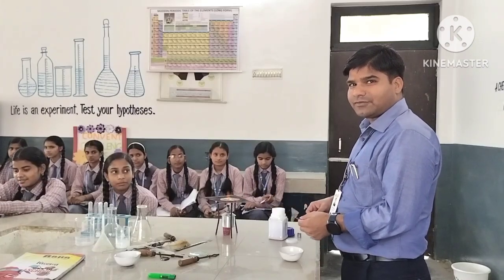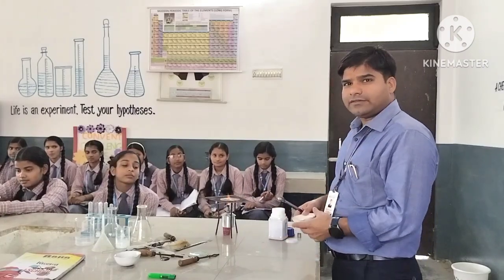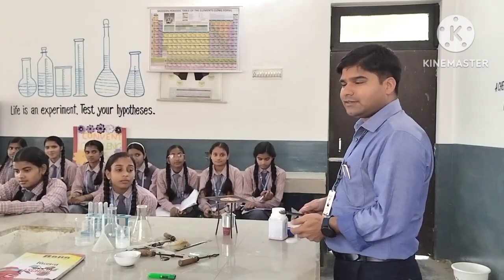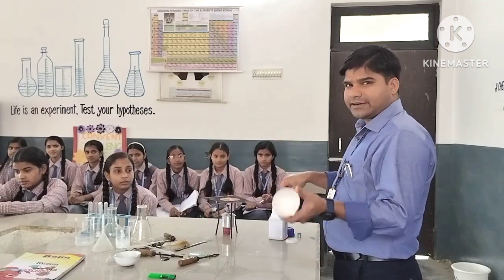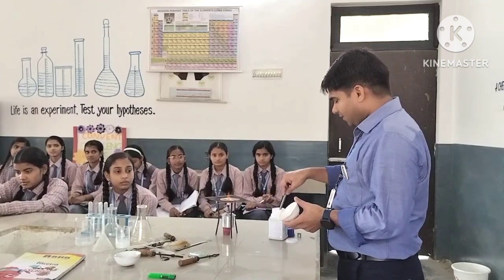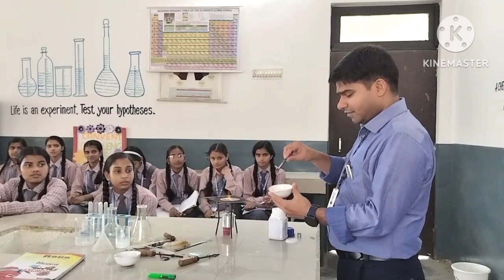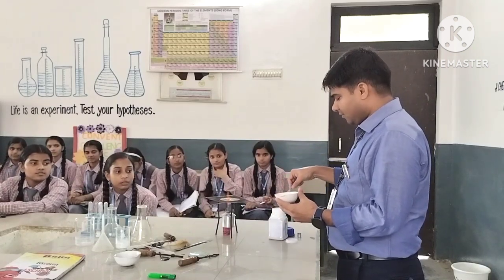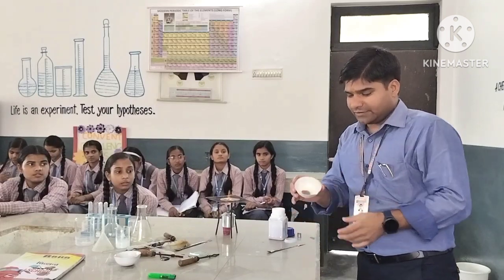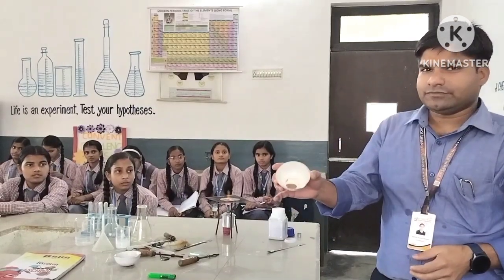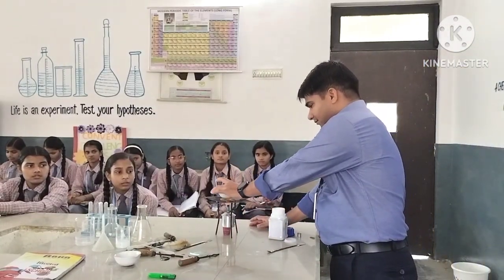Today I am performing Activity 1.1 NCERT Science class 10th chapter 1. We take a china dish and add a small quantity of copper powder, which is brown in color, and then heat it.